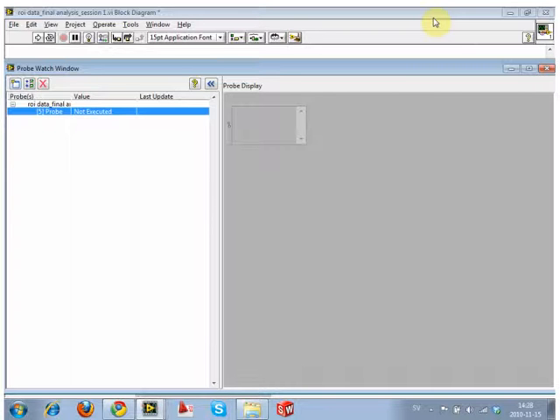Sometimes you need a separate pair of eyes to look at it. Sometimes you need to ask somebody, look at this, what the hell's that? And it can be anybody. Sometimes you've just been staring at it so long you can't see where the problem is. But one of LabVIEW's huge benefits is this ability to probe things and get an error. It's not like regular programming where it just says, you have an error. It actually lets you try to find it. So this way you would be able to find it, Celine.